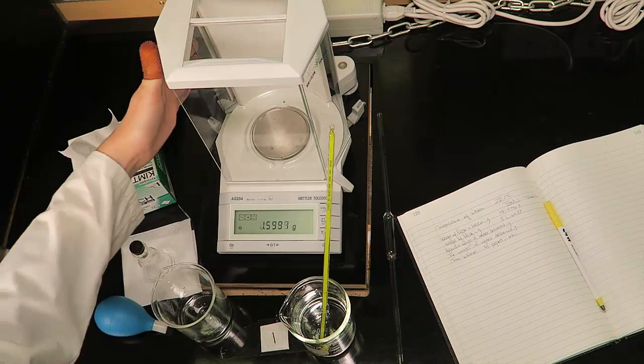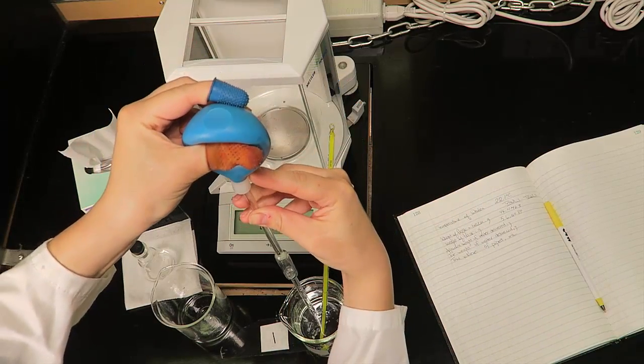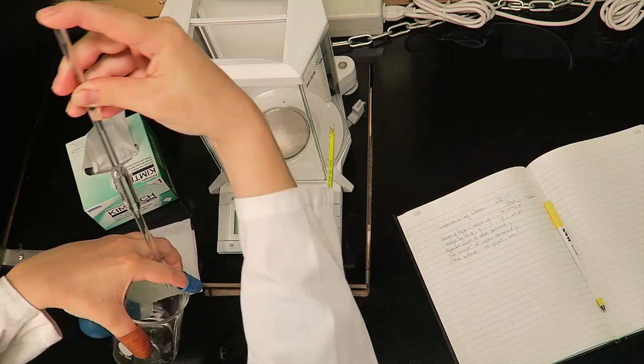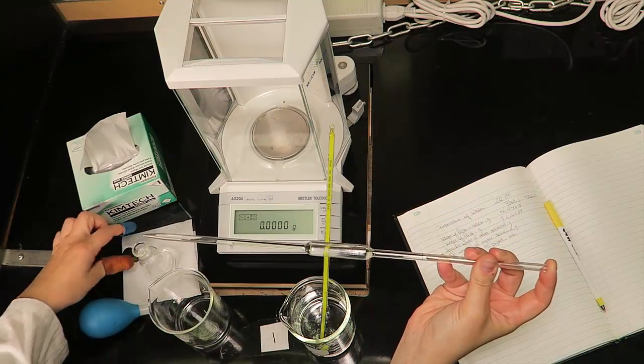Repeat the above aliquot procedure. It is important not to empty the flask between calibrations, as this will wet the neck of the flask and lead to evaporation loss. Simply add the next aliquot to the initial aliquot and use the correct masses to determine the true volume.